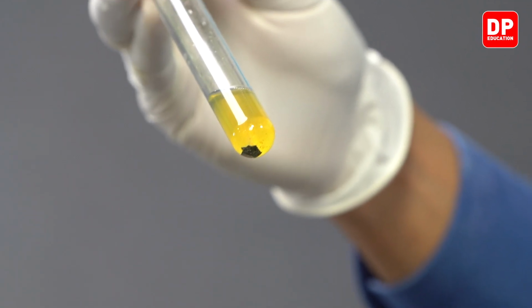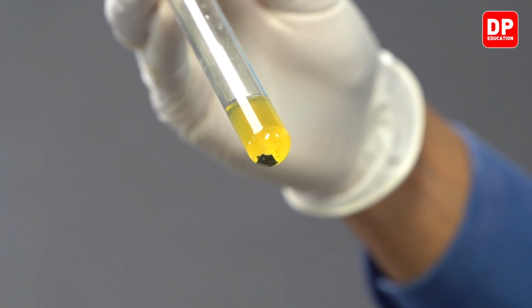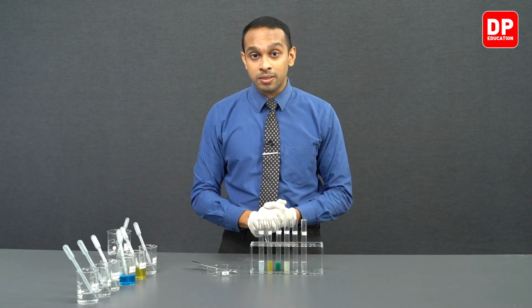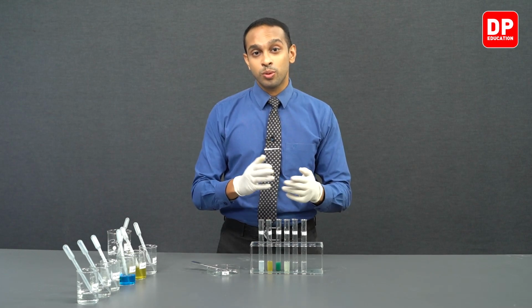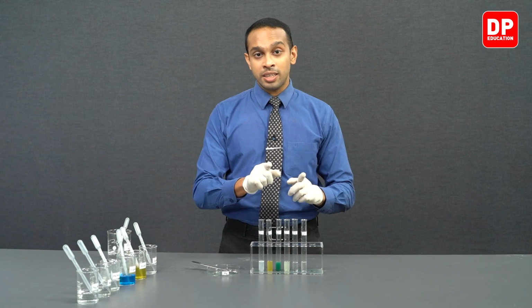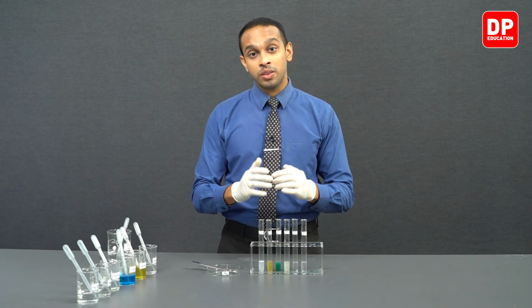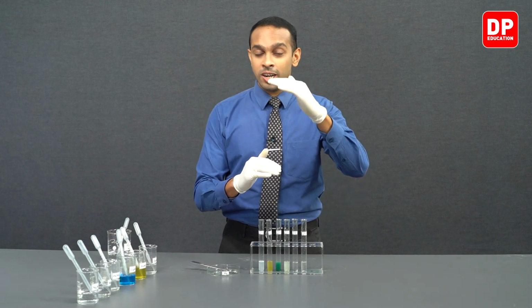However, magnesium has displaced Fe2 plus or ferrous ions as iron metal. So students, this indicates that magnesium is more reactive than iron. That is why ferrous ions were displaced as iron solid. So in the reactivity series, magnesium is found above iron. So we found out magnesium is more reactive than zinc and iron at this point.